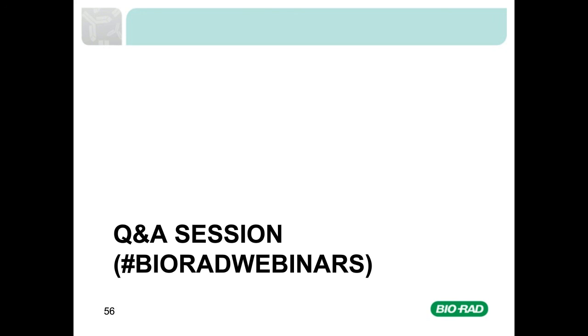The next question is, for membrane complexes, do you recommend detergent concentrations above or below the critical micelle concentration? Unfortunately, there's no straight answer to this because it will be different for every protein. So what you need to do is determine it empirically by experimenting with, probably initially, a standard RIPA buffer, and if this doesn't give you a satisfactory result, you'll probably need to decrease or increase the detergent in question until you find the best compromise.